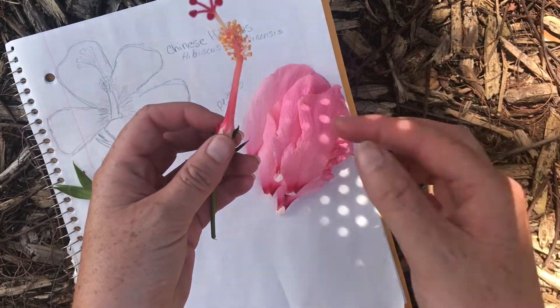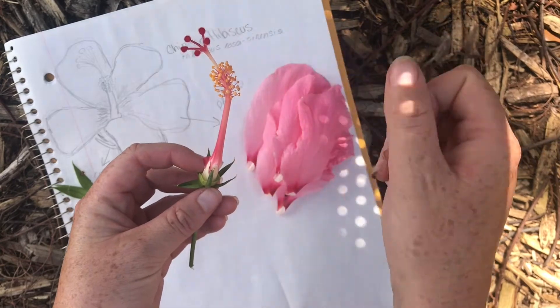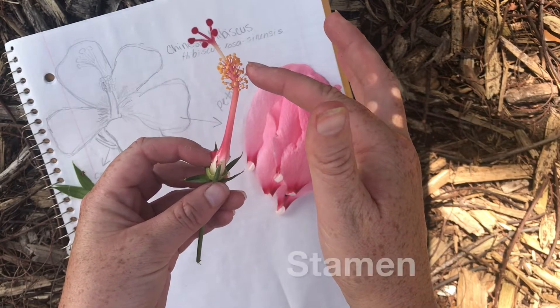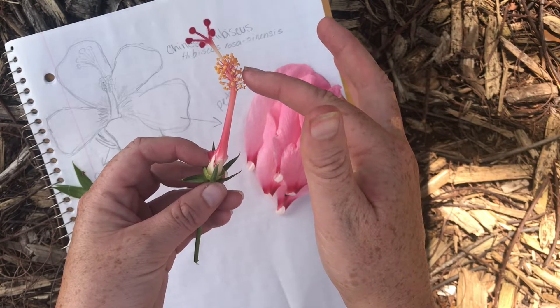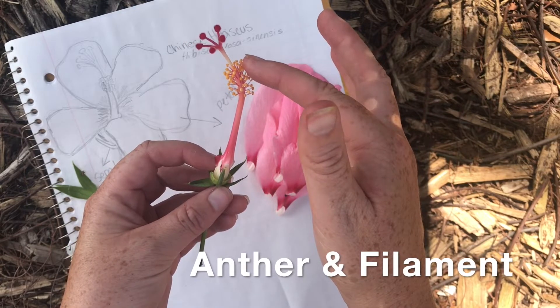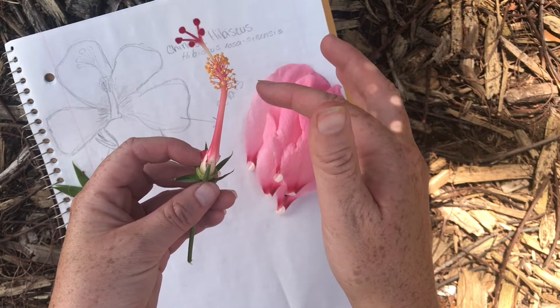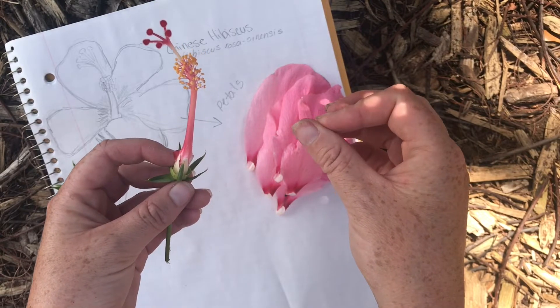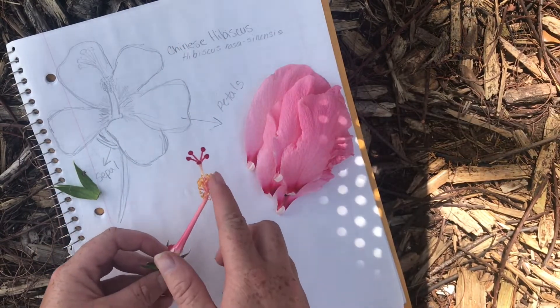Now we're going to look at the reproductive organs of the flower. The hibiscus has both female and male parts. The male parts of the flower are together called the stamen. The small little yellow balls are the anthers and they're held up by something called a filament, which are basically little tiny hair-like structures that hold them up. The anthers carry the pollen. If you rub your fingers along it and kind of shake it on your paper, you'll notice lots of yellow dust falling off, which is the pollen.